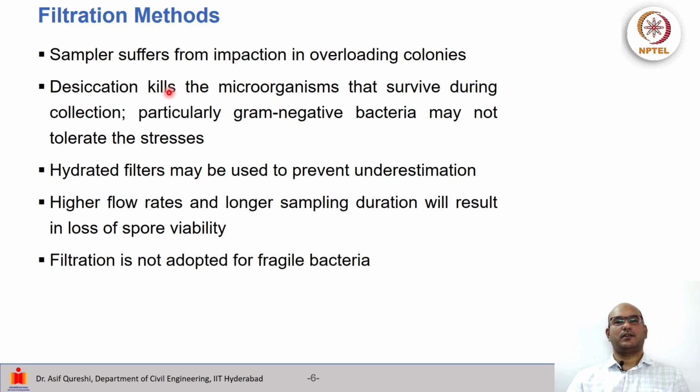Filtration methods have some drawbacks, or some caveats that need to be taken care of, in that the sampler suffers from impaction and overloading of colonies when we have a lot of colonies. The desiccation generally kills the microorganisms that may have survived during the collection.